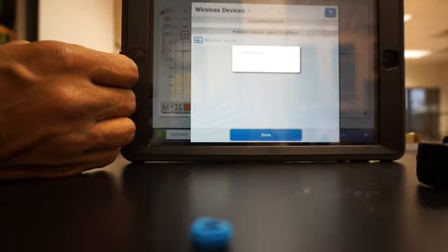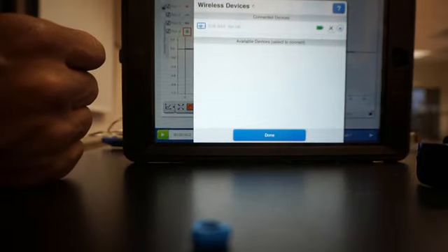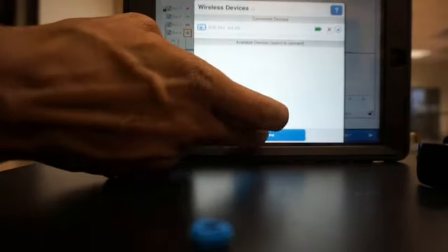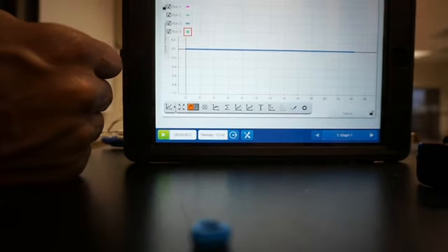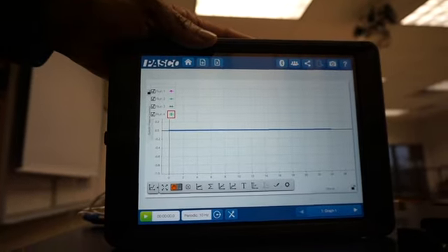It might ask you to update the dongle. Just cancel the update because that will delay your experiment. It's now connected. I hit done. That is how I connect the sensor to the iPad.